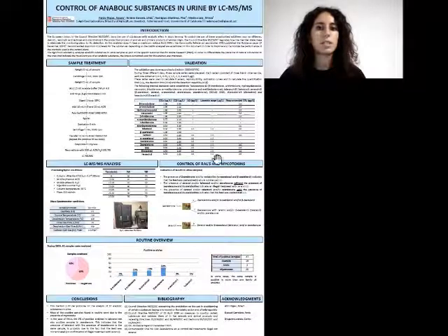It's important to control RALs and mycotoxins in order to differentiate the presence of natural substance from the ones that indicate a fraudulent use. How to evaluate the results in urine sample? There are 3 options. First, if there is the presence of zearalenone and its metabolites, alpha and beta zearalenol, it indicates that the feed was contaminated.